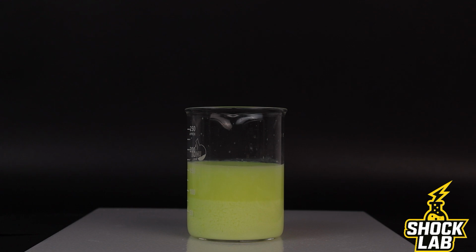What started as two separate solutions has now turned into a bright yellow precipitate. This is a classic example of a precipitation reaction in chemistry. Chemistry allows us to observe invisible ions through visible reactions like this one.